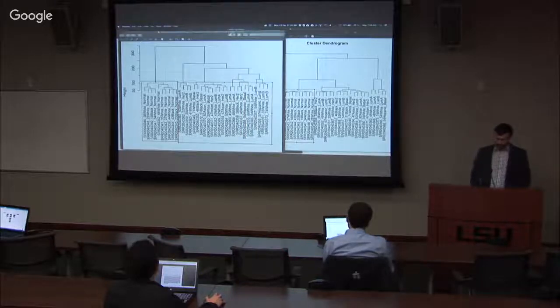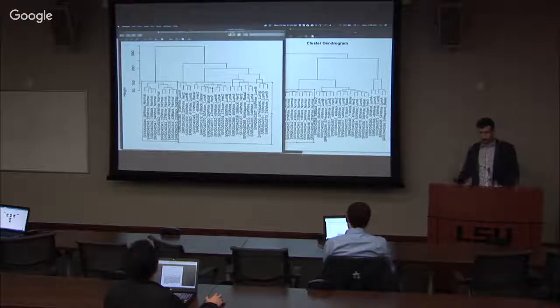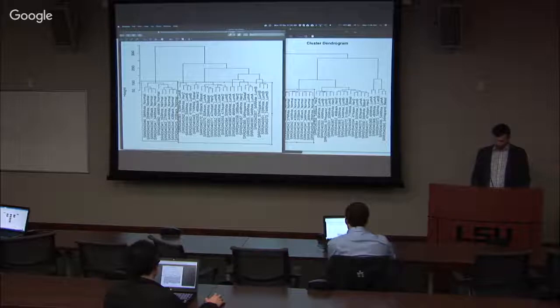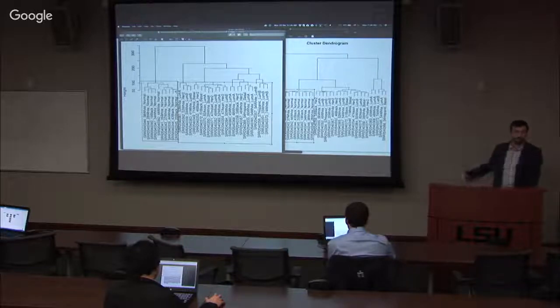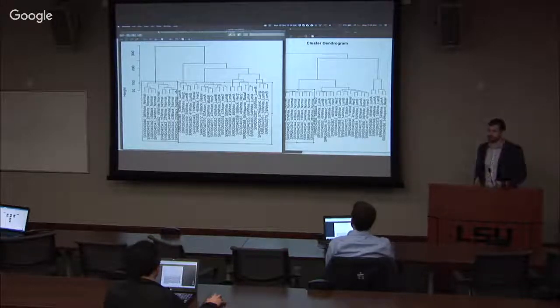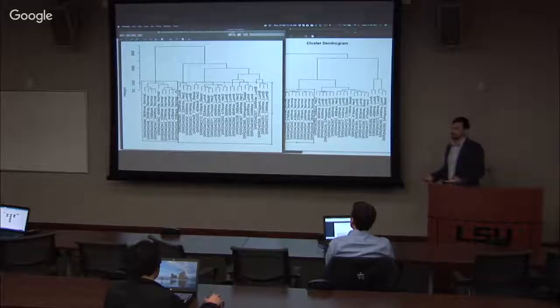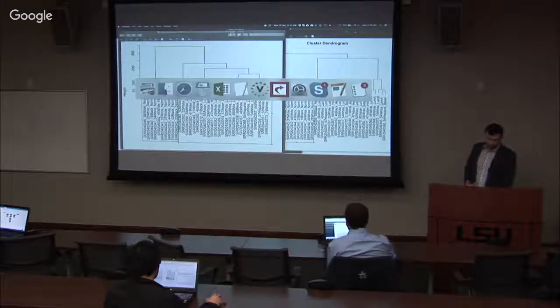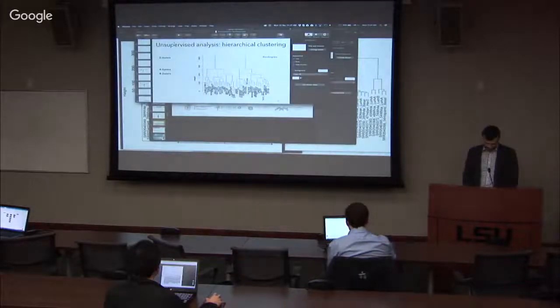But here, you can see, and you can kind of read into what might be the reasoning behind them clustered together, right? So these are all luminal B together. These are, maybe they're all white, or some other parameter that you can try to interpret. But right now, what we're interested in the context of using this is just to explore our data, right? Now consider that we have explored our data.